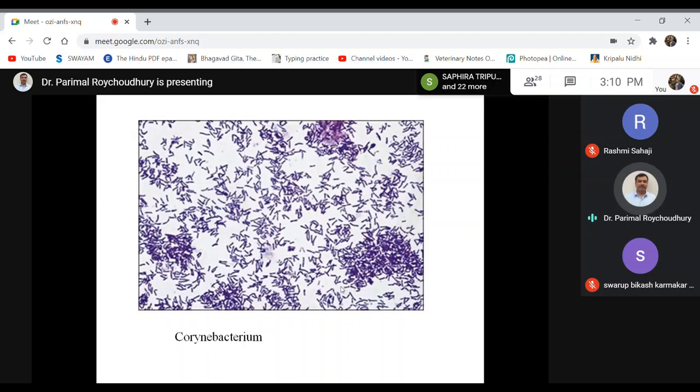There is another bacteria called Corynebacterium species, and some people describe that under the microscopic field the Corynebacterium look like some Chinese script. So one of the synonyms of the bacteria is the Chinese letter arrangement, as if these are some Chinese or Japanese script written somewhere. But in all textbooks, you'll find this commonly described as Chinese letter alphabet arrangement. It is related to Corynebacterium.